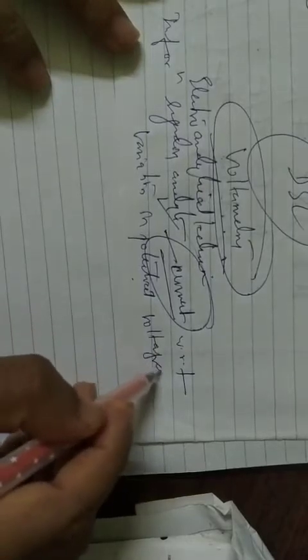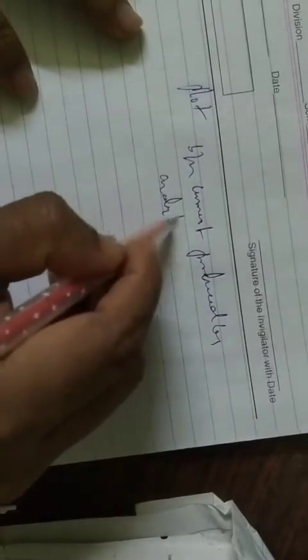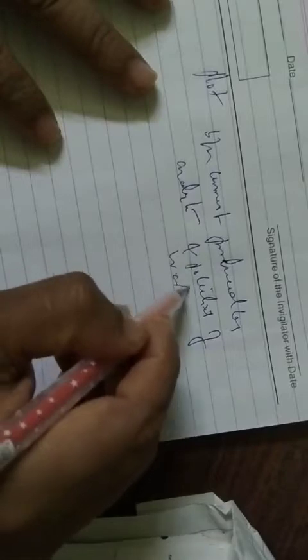And the data is represented in the form of a voltammogram. Whatever data we are going to get is measured in the form of a voltammogram, and the plot we make for voltammetry is between the current produced by the analyte and the potential of the working electrode. This is very much important.